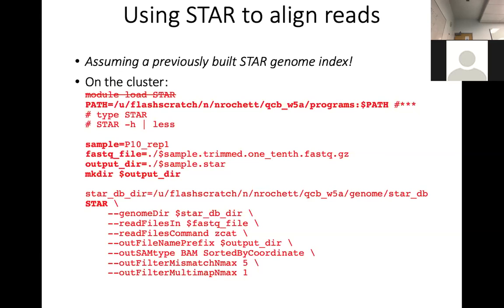So we include the module and then we put that again. Just copy paste one, otherwise just continue pasting it from the log.